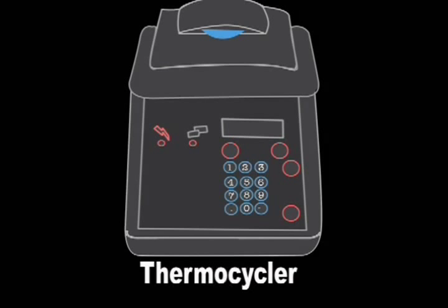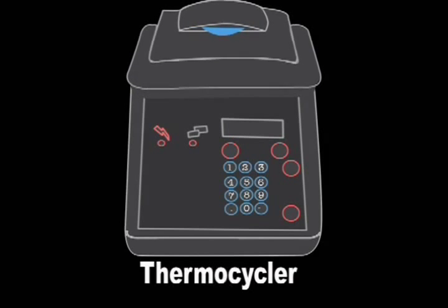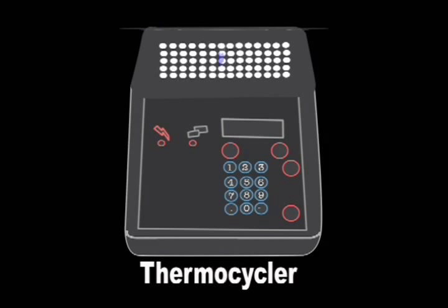We will start our procedure today by taking the PCR tube out of the thermocycler to complete the final steps of PCR.